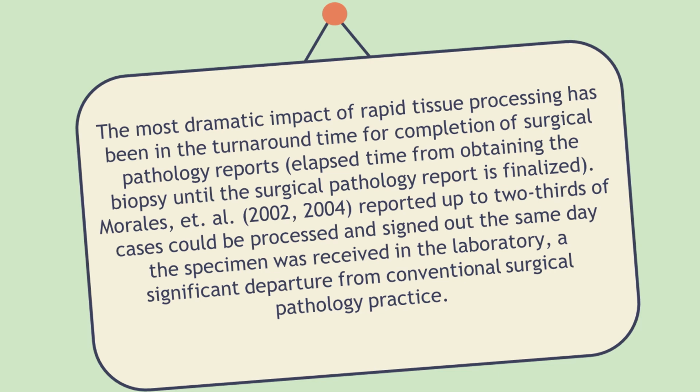So the most dramatic impact of rapid tissue processing has been in the turnaround time for completion of surgical pathology reports. It is reported that up to 2/3 of cases could be processed and signed out the same day the specimen was received in the laboratory, a significant departure from conventional surgical pathologic practice.